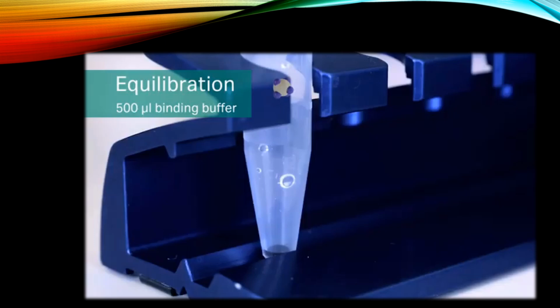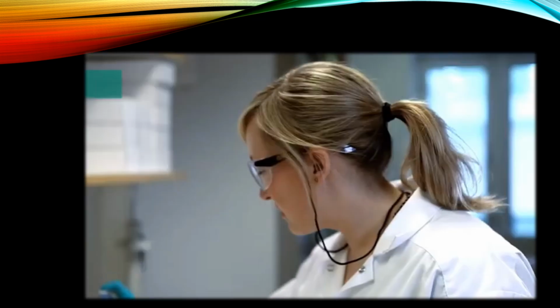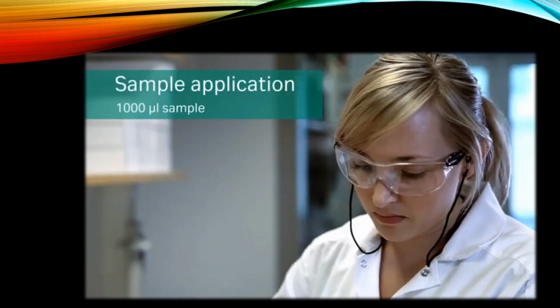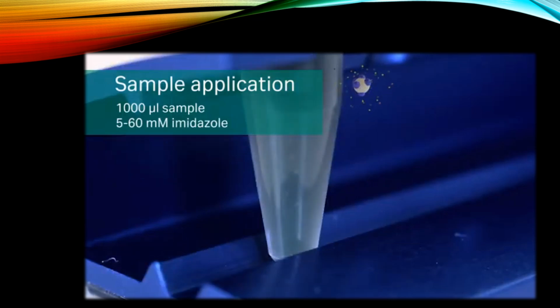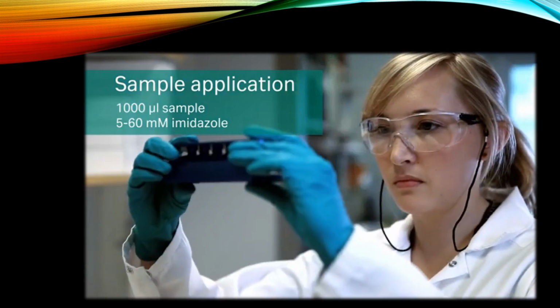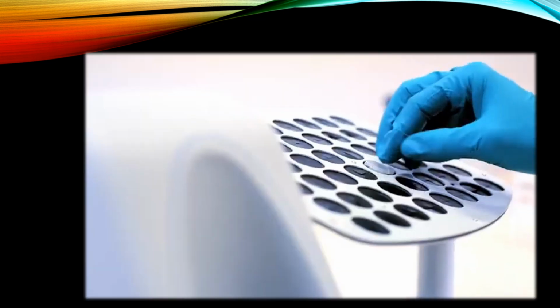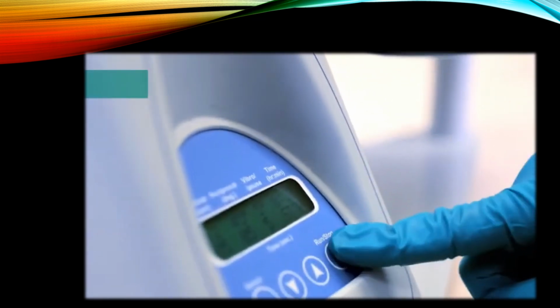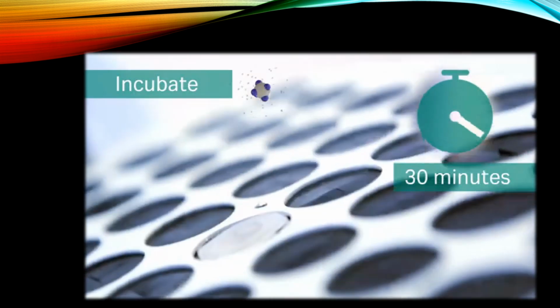Add 500 microliters of binding buffer with 5 to 60 millimolar imidazole. Immediately after equilibration, add 1,000 microliters of sample containing 5 to 60 millimolar imidazole. If the sample volume is less than 1,000 microliters, dilute the sample to 1,000 microliters with binding buffer. Resuspend the medium and incubate for 30 minutes with slow end-over-end mixing or by using a benchtop shaker.